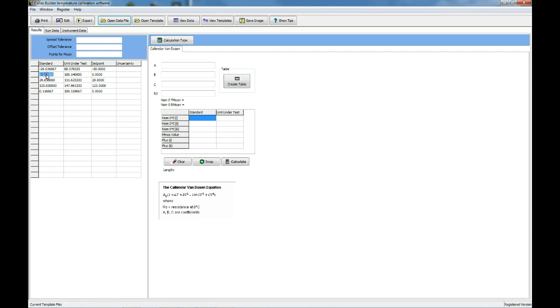So to start our calculation, again made simple for you, you pick up and drag and drop the temperatures into their relevant boxes. So there we are, we're dragging those in, release, drop. Now you can type them manually should you wish, but Caliso Temps is there to make life easy for you. Drag, drop, drag and drop. So there's your data picked from the test.